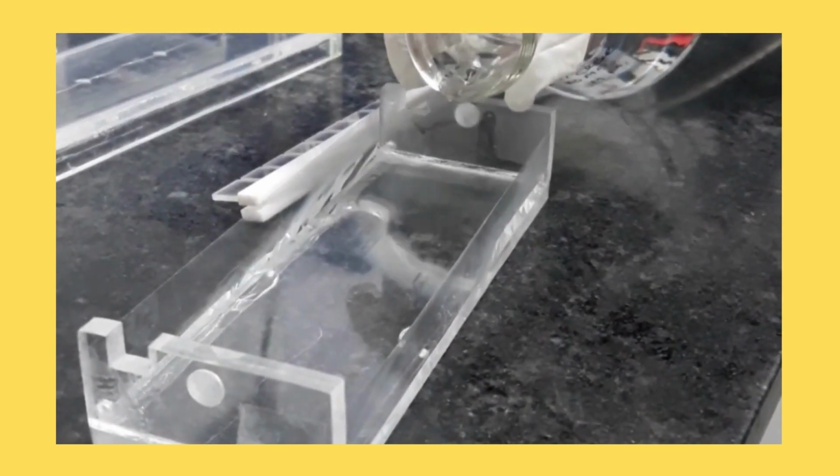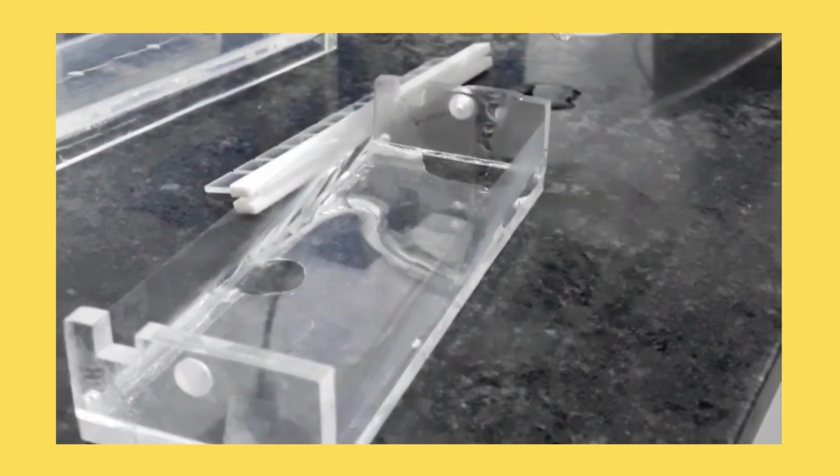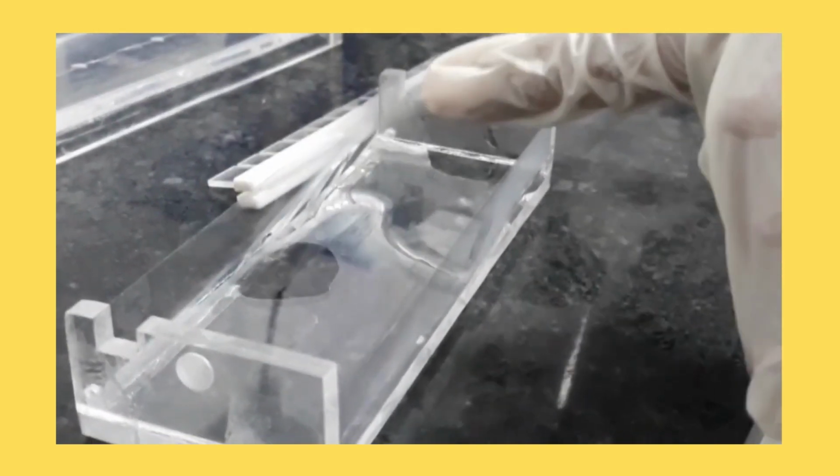Now pour the agarose into the plate and make the wells with the help of a comb.